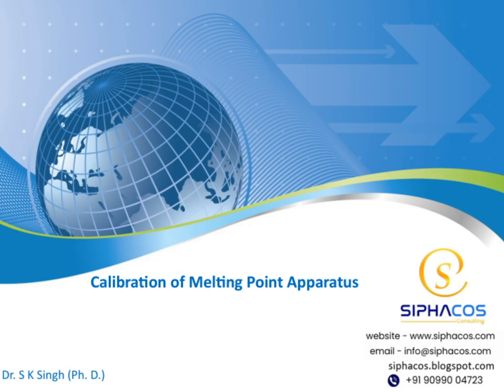Today's presentation is titled Calibration of Melting Point Apparatus, and it's designed to give you a clear understanding of how to properly calibrate this essential instrument. We'll cover the basic principles, the step-by-step process, and some best practices to ensure accurate results. So without further ado, let's get started.